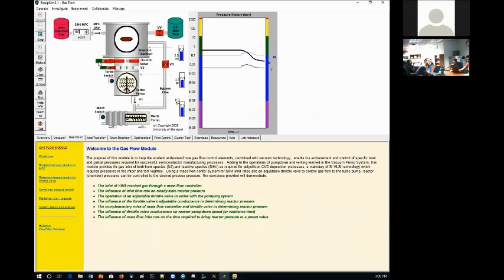You guys see that? So I have full control over the reaction chamber, over the throttle valve. I can set the pressure to the value that I want. That's one way of controlling things. The other way is, of course, to flow in the right amount. So that's going to be a linear response. I'm hoping that if you do 10 only, you will see 9.4 times 10 to the minus 4. Let's see. Yeah. So that's going to bring us 1/10 of the pressure that we were aiming for.